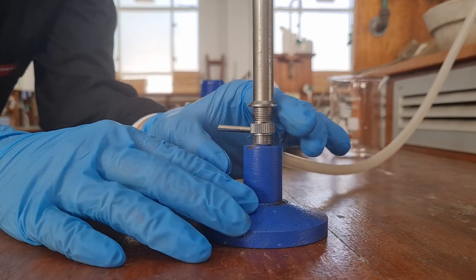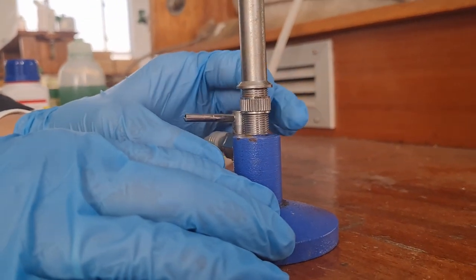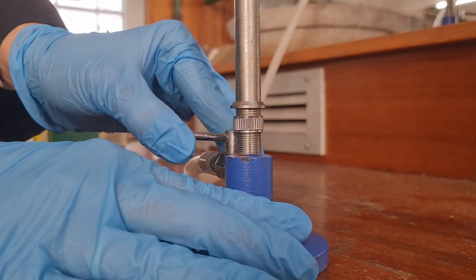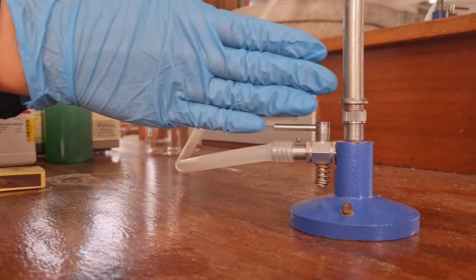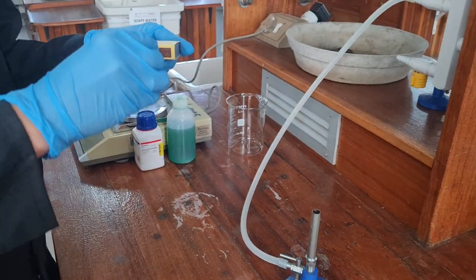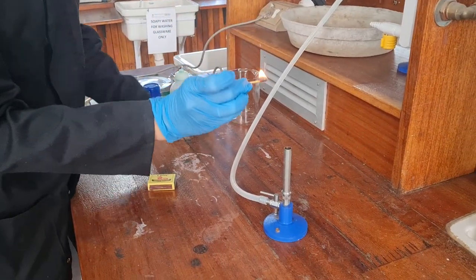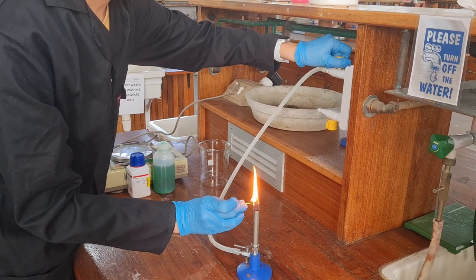How to light a Bunsen burner. It is important to close the air hole by rotating the collar. If the Bunsen burner has a side lever, ensure that the lever is open. Light your match and hold it above the opening of the barrel. Slowly open the gas tap at the bench by lifting the tap up and then turning it.